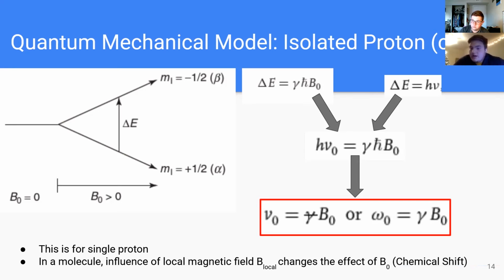molecules with larger nuclei and electrons surrounding the nuclei, they each have their own magnetic field associated with them. And that can affect the larger magnetic field applied, which also affects your magnitude, which affects B sub zero. And so once affecting that, you get this chemical shift associated, which now this value of frequency you're looking for, it's now like a spectrum sometimes or a shift. And so that's why this chemical shift effect becomes pretty important in terms of chemistry and biology.